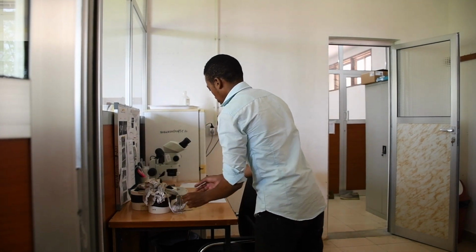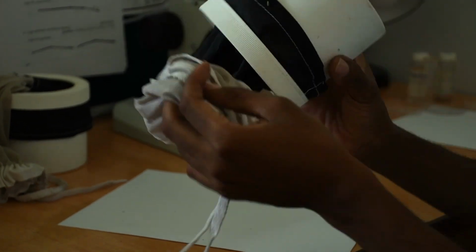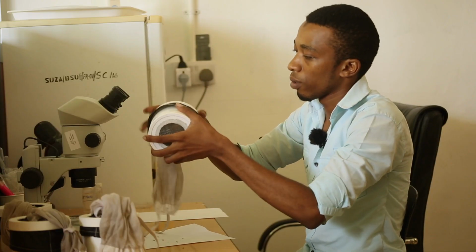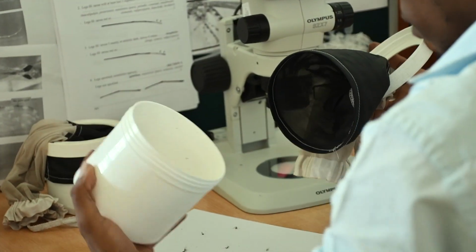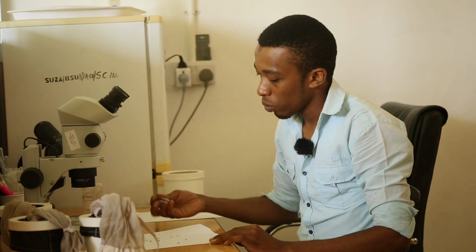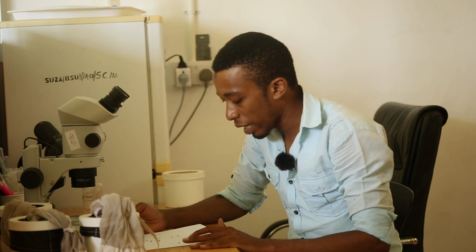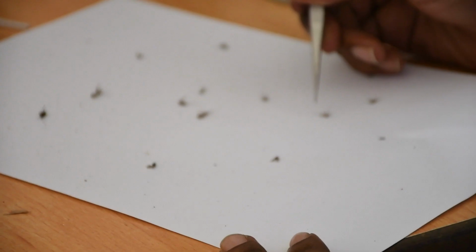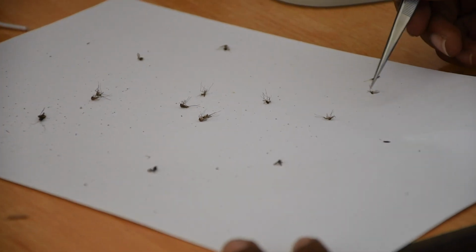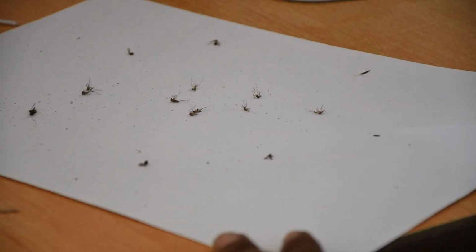So once we've retrieved the samples from the cooling box, we now proceed to identification, where we remove the mosquitoes from the trap. And then we open it. Now, we can choose to identify with our naked eyes if we can detect the presence of multiple species of mosquitoes. We can also use the aid of a microscope.